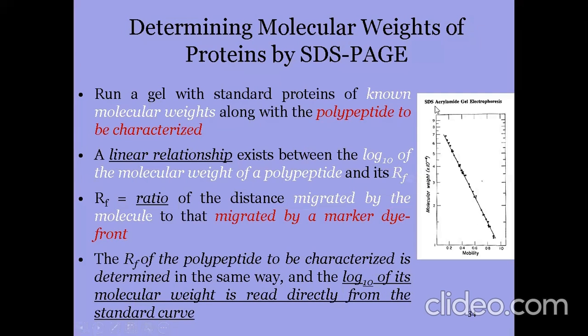And this is actually SDS acrylamide gel electrophoresis. Am I clear?